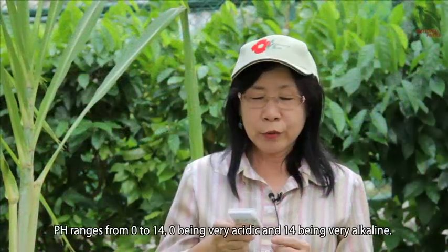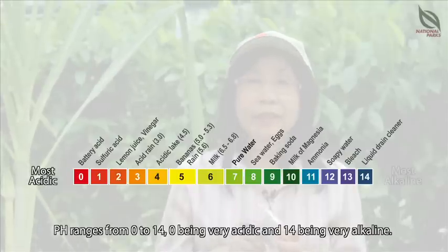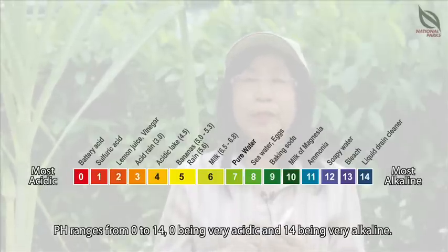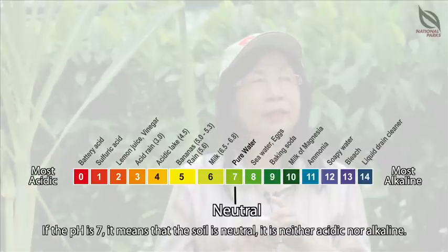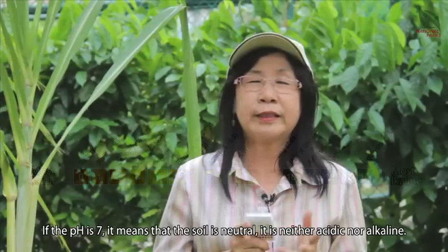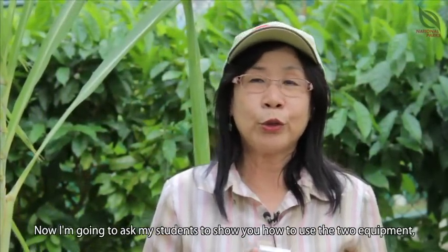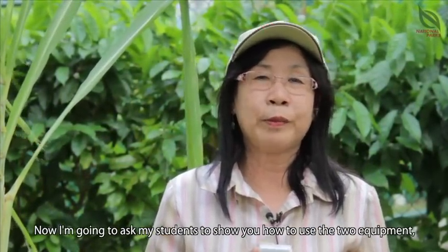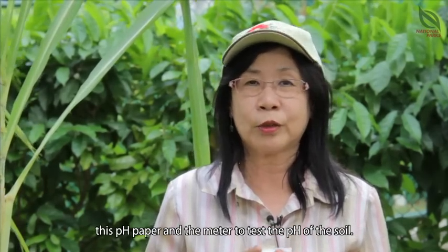The pH ranges from 0 to 14, with 0 being very acidic and 14 being very alkaline. If the pH is 7, it means that the soil is neutral — not acidic, not alkaline. Now I'm going to ask my students to show you how to use the two equipment, the pH paper and the meter, to test for the pH of the soil.